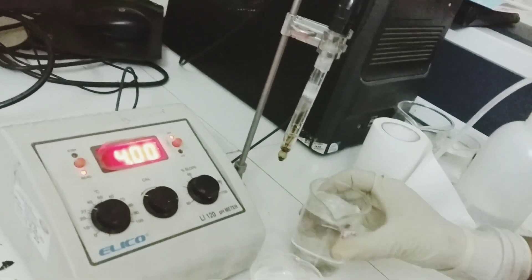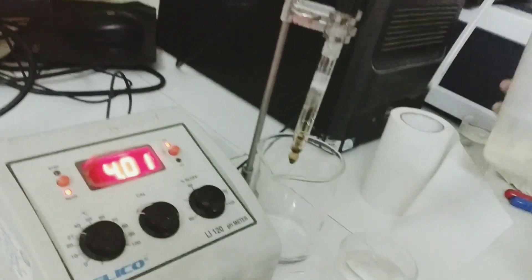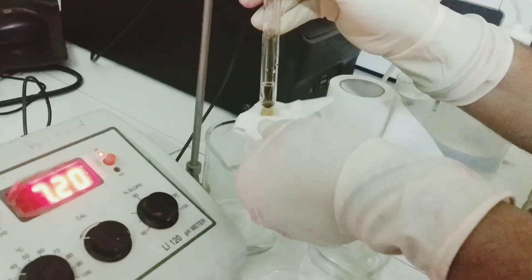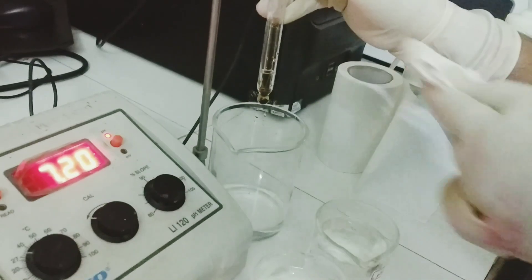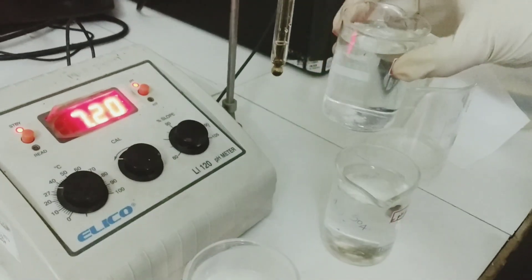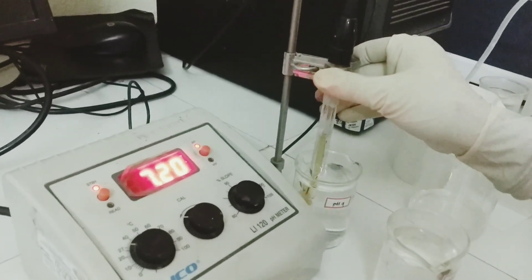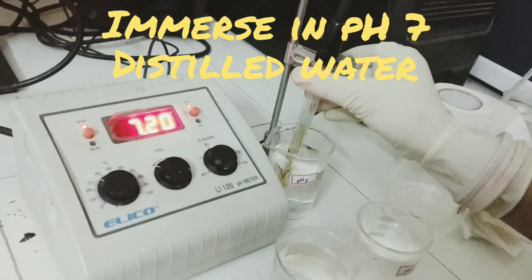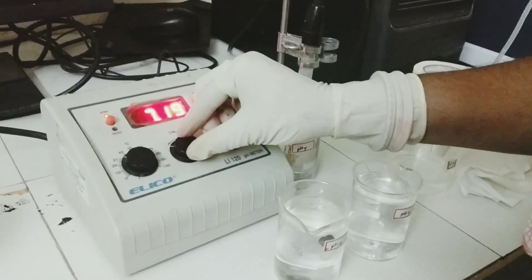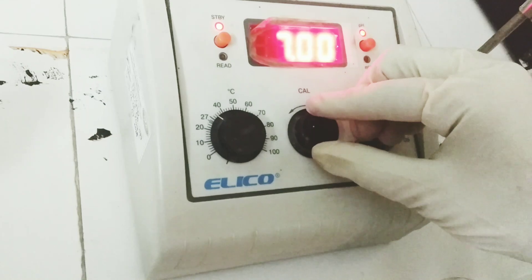Now I am taking away the pH 4 buffer solution and washing the electrode bulb with distilled water, cleaning the membrane. Then placing the electrode in pH 7, which is nothing but distilled water. It is showing 7.20. With the cal knob, I have adjusted it to 7.